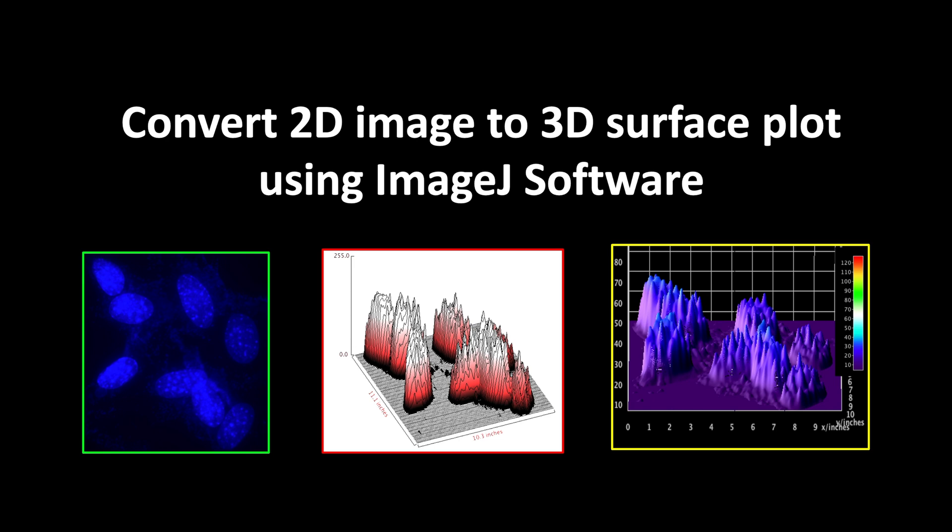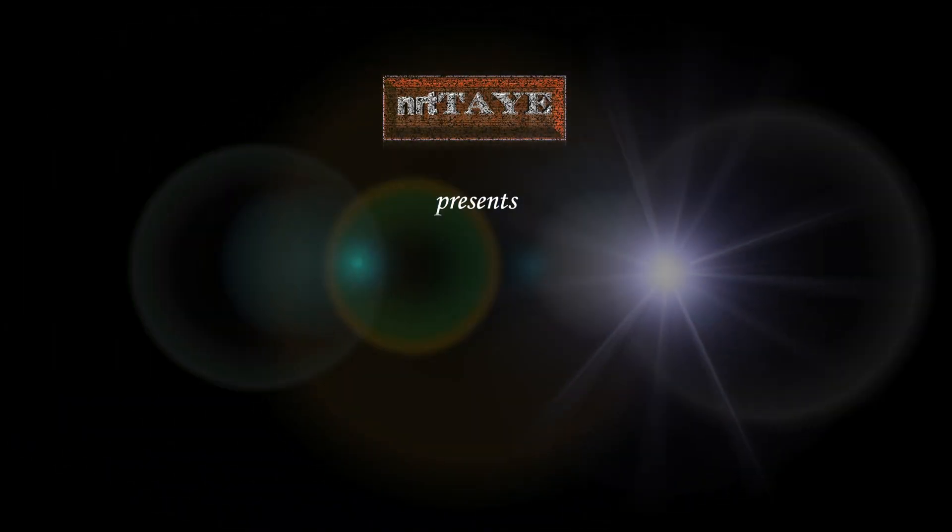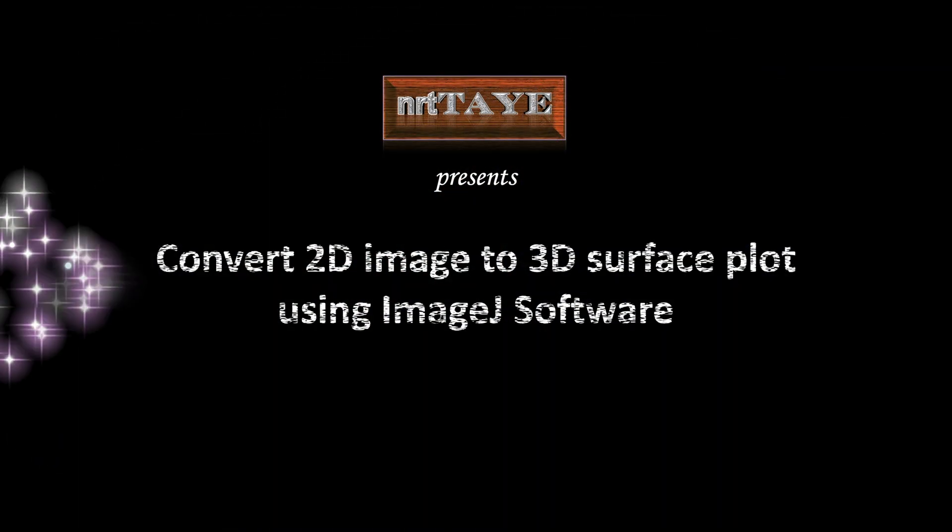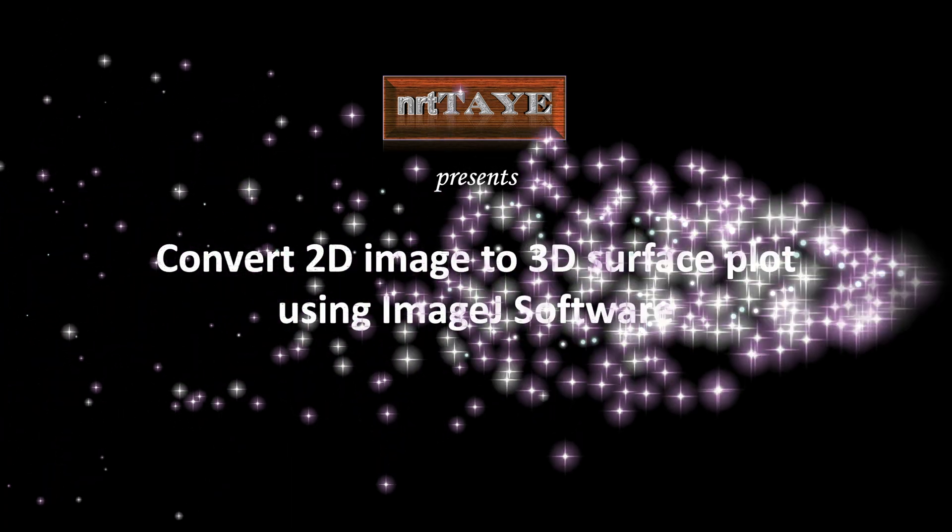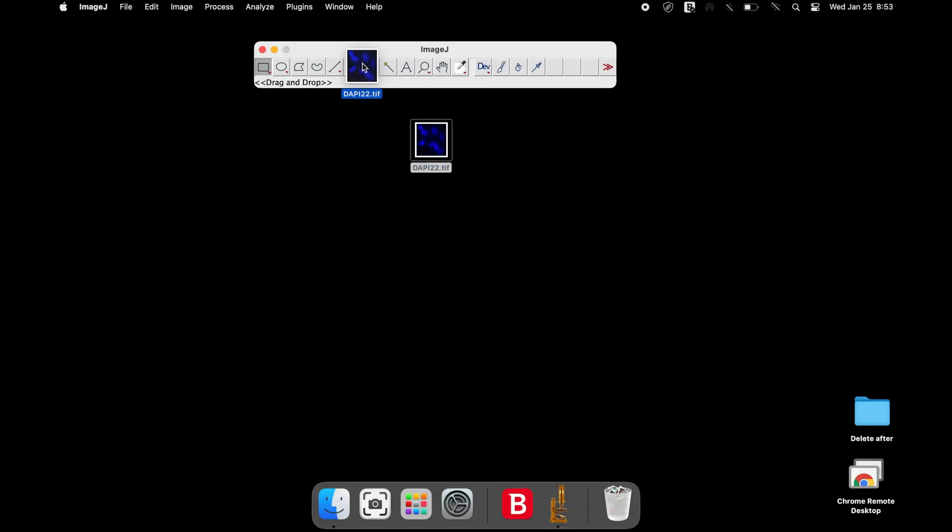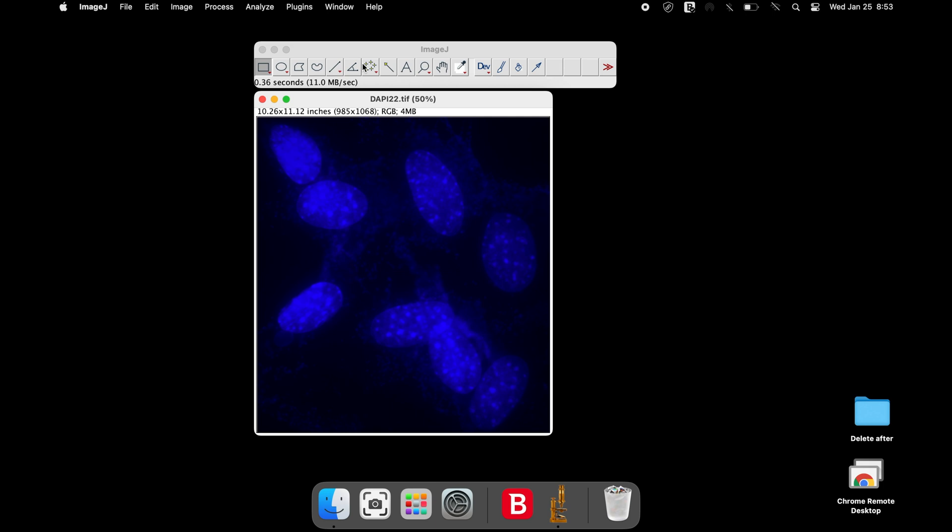In this tutorial, we will learn to convert 2D image to 3D surface plot. Open the image of your interest in ImageJ.